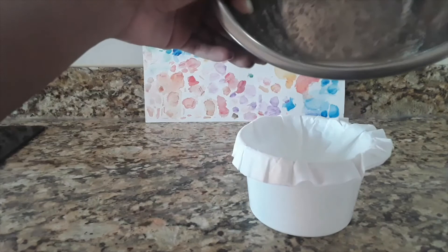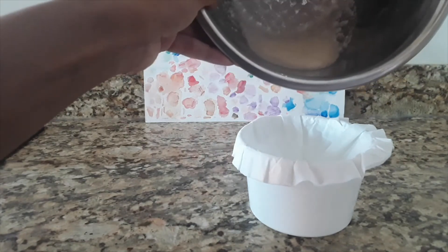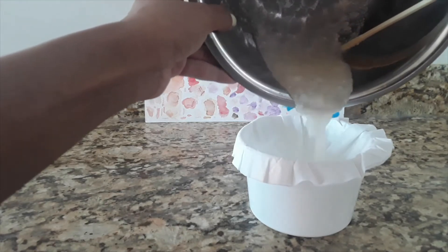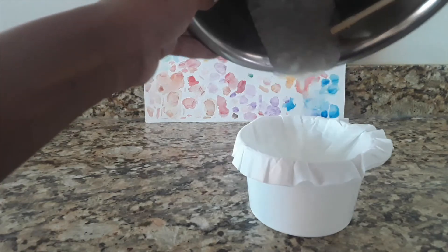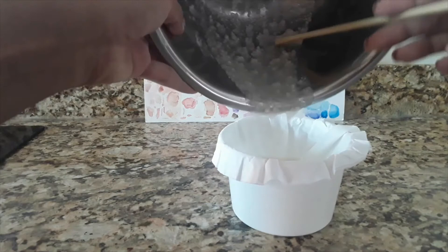Then I'm going to strain it in my lovely little filtration setup. I tried to pleat up my filter paper, but do whatever works. You can use a rubber band to secure the paper.